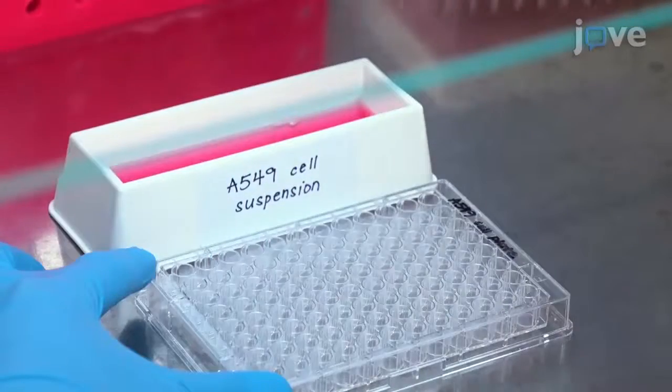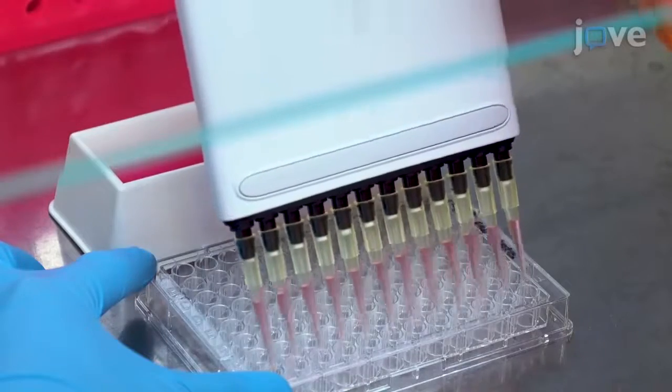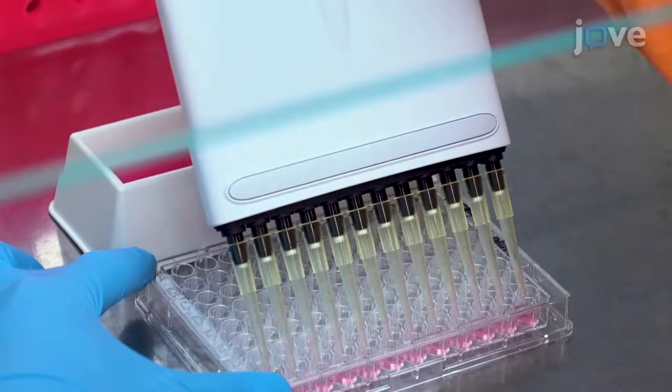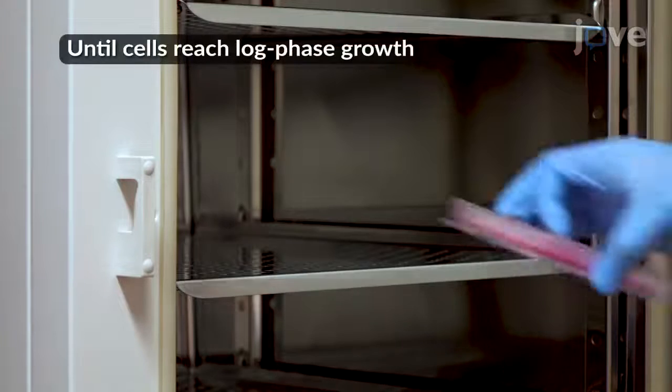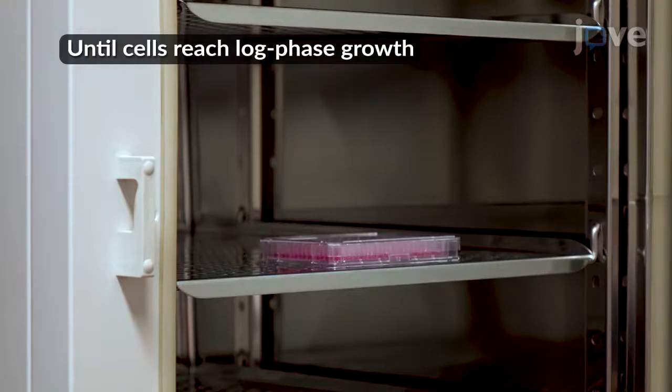Then seed 96-well flat-bottom sterile plates with 40,000 A549 cells at a density of 100 microliters per well. Incubate the plate at 37 degrees Celsius in a 5% carbon dioxide environment overnight.